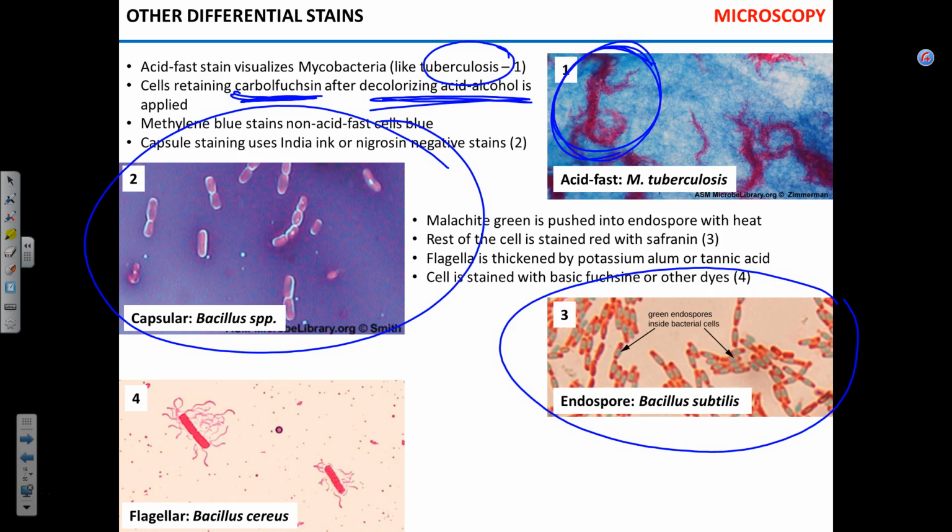Remember when we examined your hand wash samples? I think some of you had these big, gigantic colonies, very odd looking. You remember? No? Usually it was smaller white, smaller yellow, but in a couple of plates there were big colonies. That was Bacillus. What happened is you collected the endospore from somewhere, touching something dry and dusty.